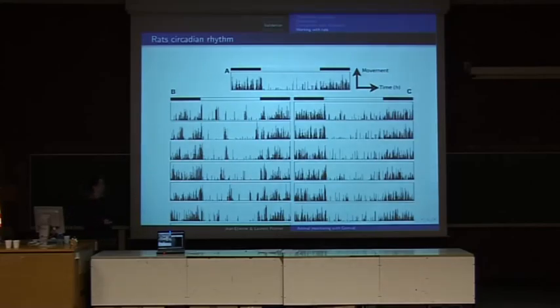After that you take the output and you plot them in what we call actogram. It's the amount of movement versus the time and here each block is one day. The dark block above are the night or dark phase and the day or light phase and everything starts at midnight. As you can see, the rat is more active during the dark phase than the light phase and this rat was quite interesting because all the time around ten, eleven, he just jumped out and did something. All these were collected automatically so no intervention. The rat is just there, food is available, water is available and no human intervention. After that we can say this rat was compliant with the treatment or not compliant or did well or did not well depending on your experiment.